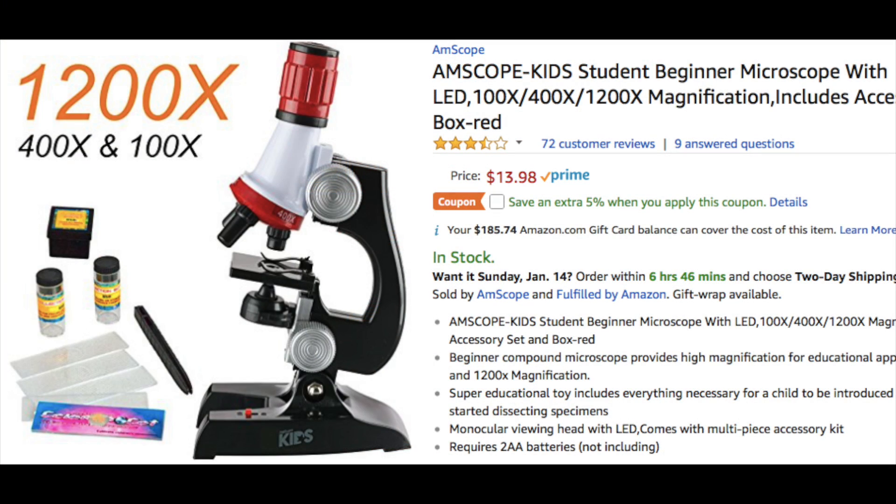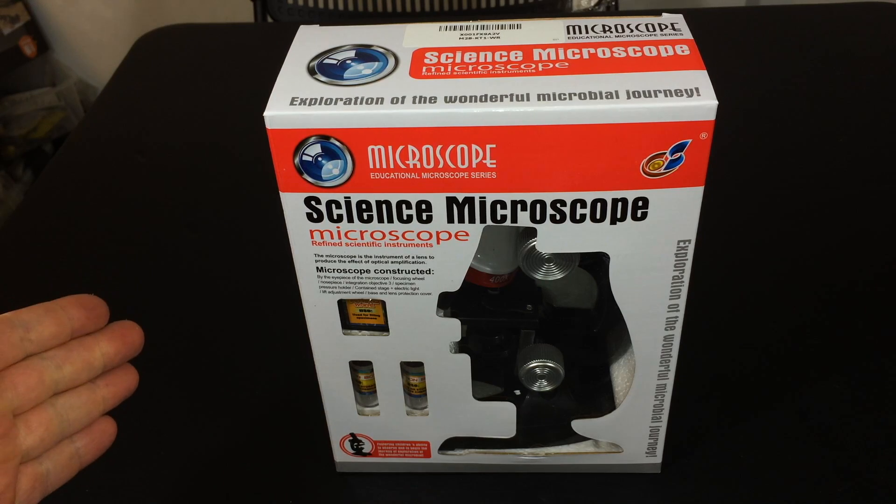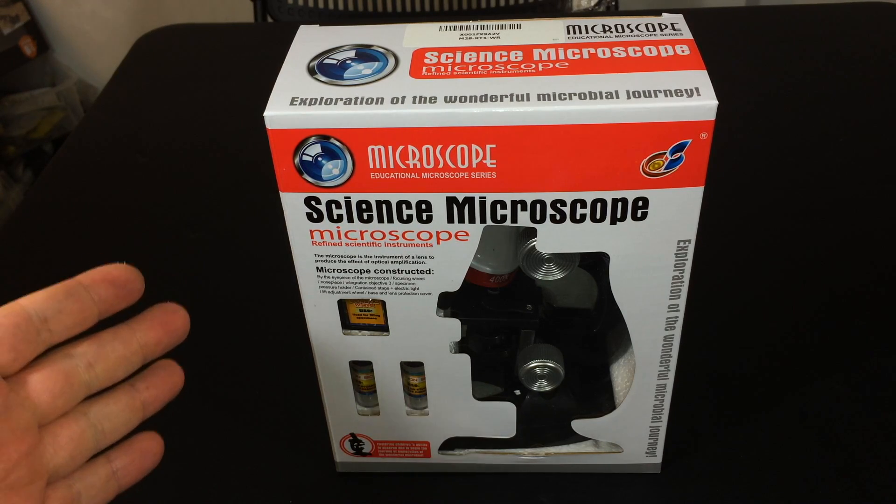This one was on a lightning deal. I wound up paying less than $6 for it, but the normal price is around $12 to $13 on Amazon, but still at around $10 or so on average. These are really cheap, but I wonder how great they actually are.